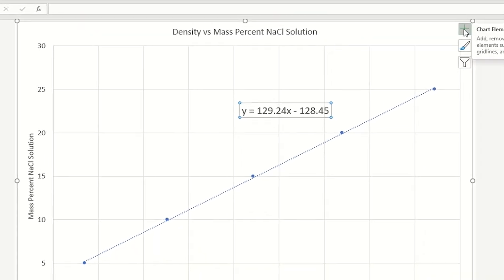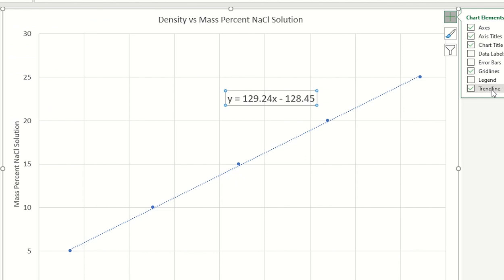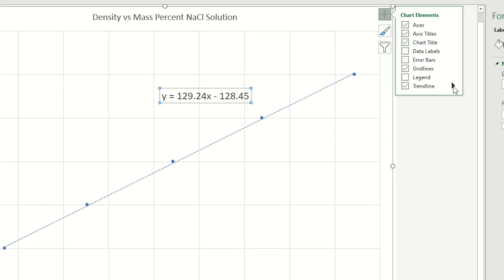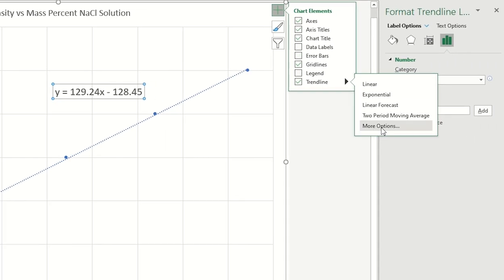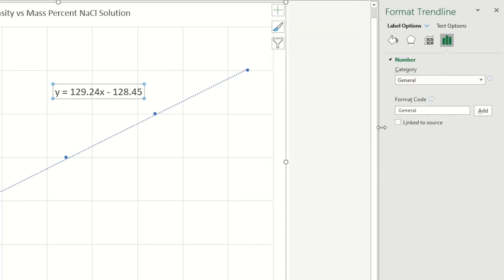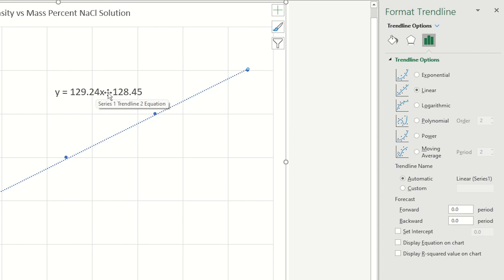I went to the plus sign and added the trend line. I went to more options. And I set this box display equation on the chart. And that gave me this equation. This is the equation that I want to use for my calculations.